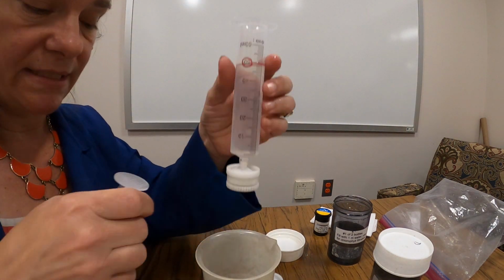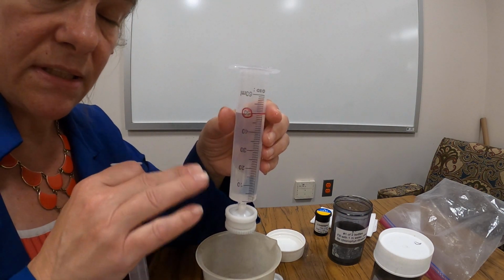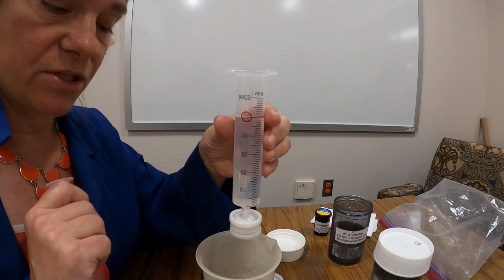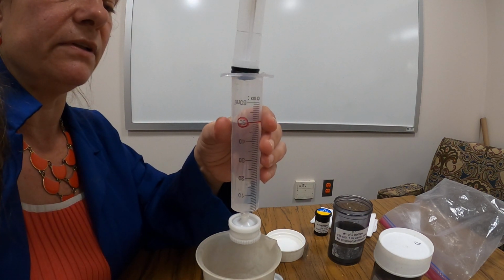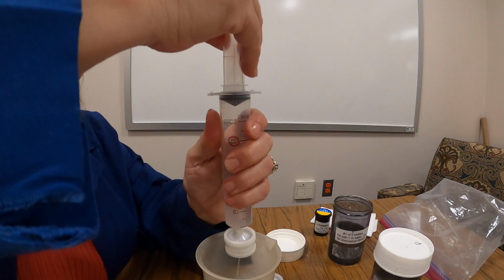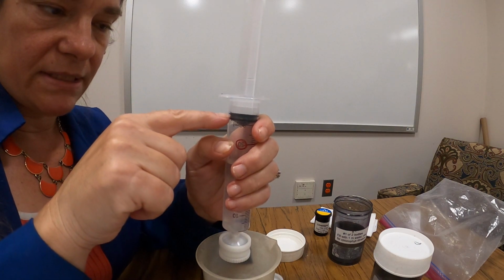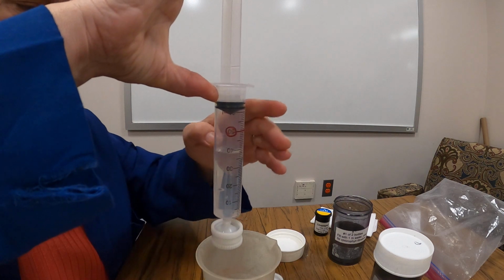So now I can take my finger off because I've got my measurement. And most of the time you're just going to discard the water. So I've got a container here. I'm going to keep my syringe nice and vertical. That will let the water move across the filter more evenly. I'm going to carefully push the plunger down. And I find if you push it down and twist it, it allows it to break through that seal. You get that snapping noise. Now you know your plunger is in position.